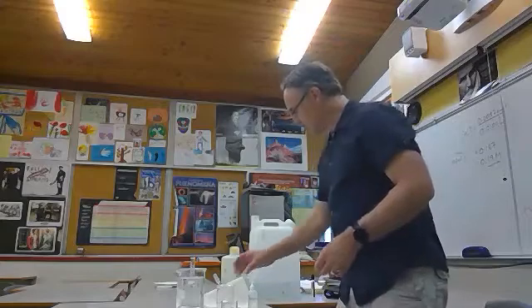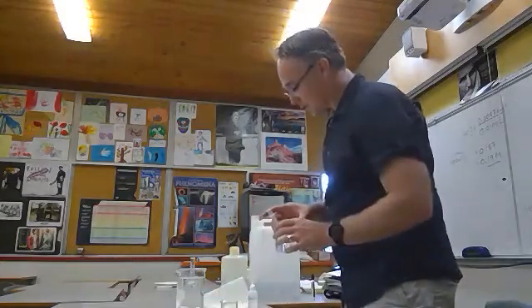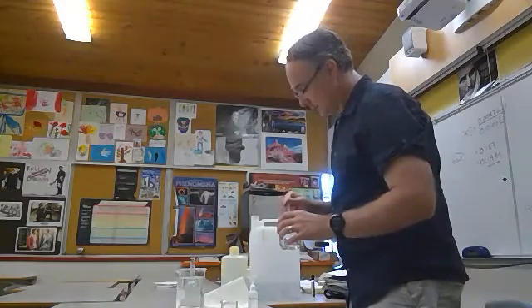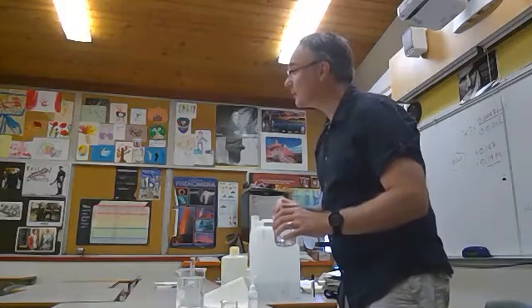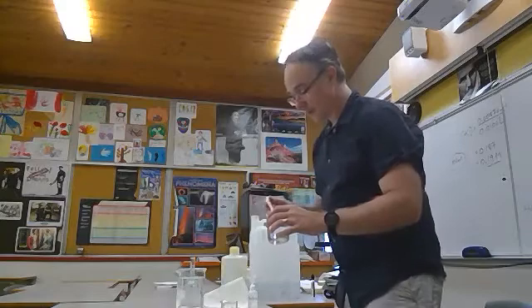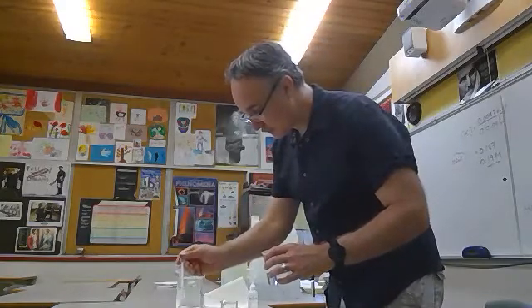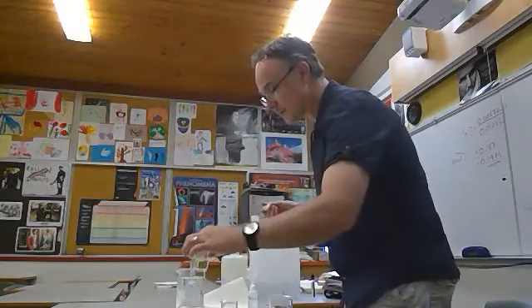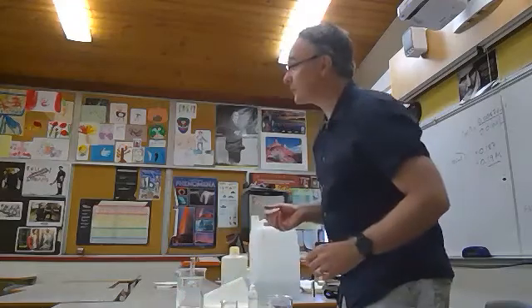And so what I'm going to do is take some hydrochloric acid and add that to a small beaker here. Okay? So it should turn more, which way do you think? More acidic, right? And so do you think it will become more yellow or more blue? More yellow, yeah. So hopefully, I haven't tested this one yet. Fairly yellow there. And then, yeah, quite yellow now, right? So it just takes a bit of time.